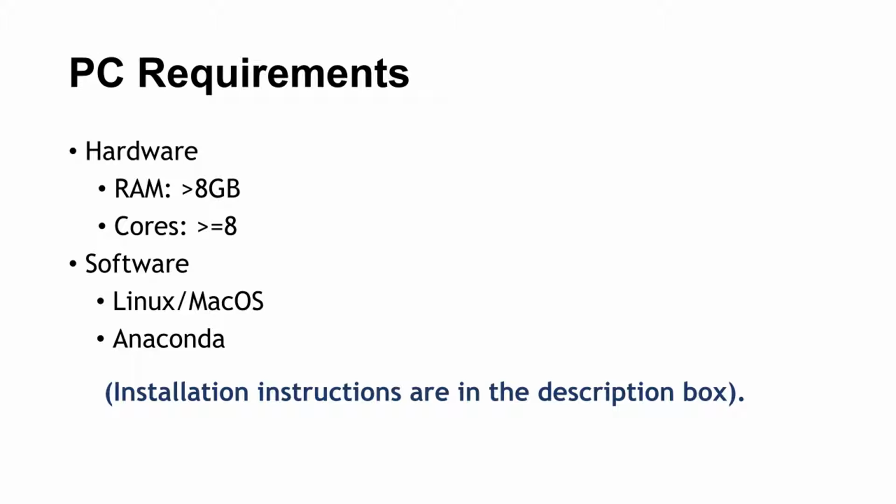Now, if you want to follow this tutorial, you need to make sure your PC satisfies these requirements. In terms of hardware, you should have a computer that has more than 8 GB of RAM. And you should also have a computer that has at least 8 cores. Okay, so the minimum cores I recommend is 8.